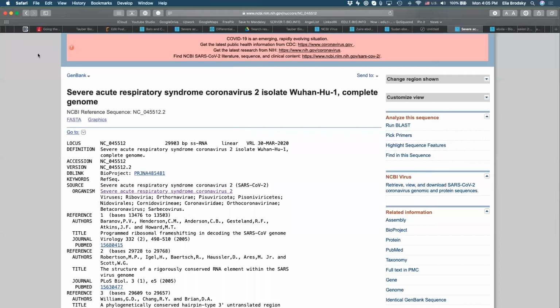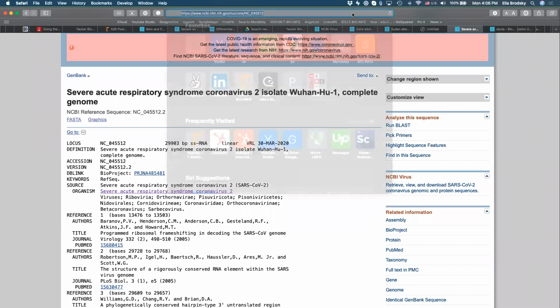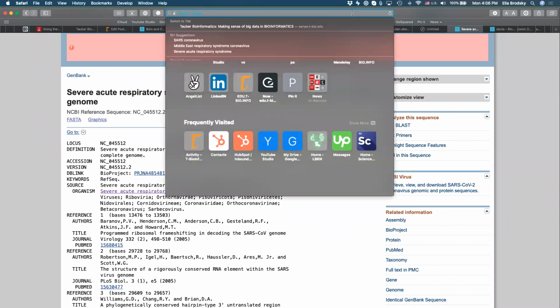So once we do this step of preparing the data for analysis, and we know that we've selected an equal number of sequences, the sequences are complete and they're high quality, and we would like to understand how they relate to each other, which ones are more similar, which ones are more distant from each other, let's go start the analysis.